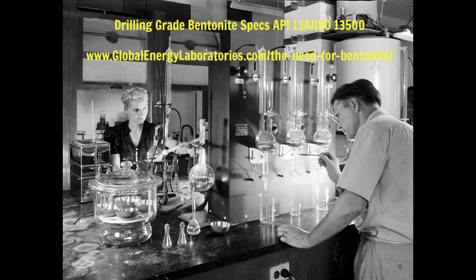The cup is pressurized to 100 pounds. You've got a filter cake, and water drips through the pinhole. If you are interested in looking at the drilling-grade bentonite specs, head over to our website, globalenergylaboratories.com, and search for bentonite to check out the specifications for drilling-grade bentonite.